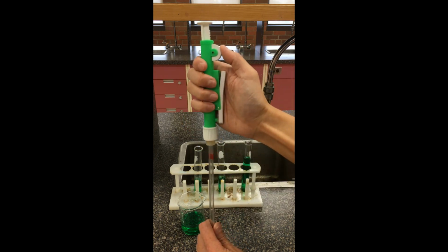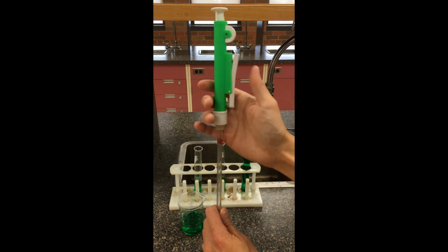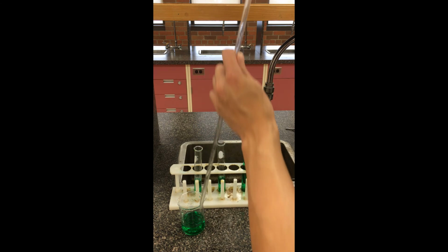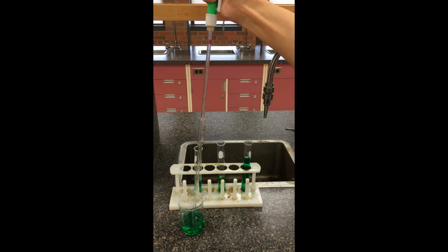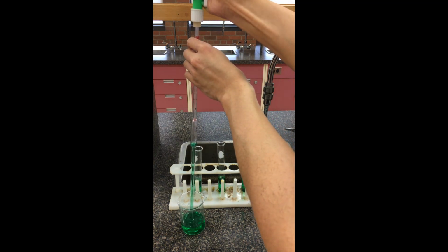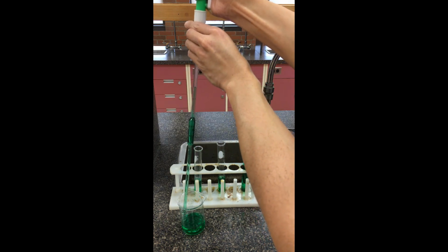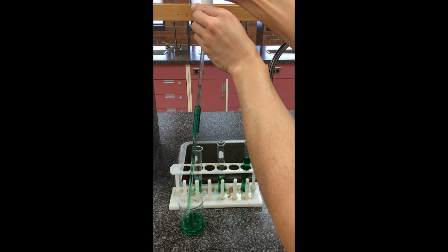If you go too far here, you can actually just dial the wheel backwards. When you're done sucking up the 10 milliliters, you just press this button and that's going to dispense the 10 milliliters. So I know this is slightly off screen here, so I'm just going to hold that open end underneath the solution. I'm dialing the wheel here. You're seeing that the solution is coming upwards, okay? Again, what's nice about this wheel is, let's say I go over, right? So I'm beyond the line that I want. I'm actually just going to dial the wheel the other way, and that's going to give a controlled release.